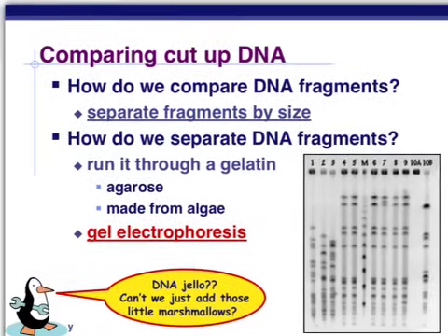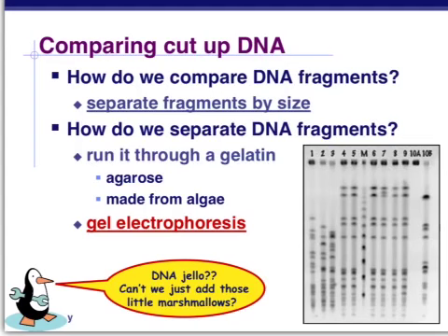And here's a picture of what that gel with those pieces would look like. The little dark regions that you're seeing, that would be the actual DNA.